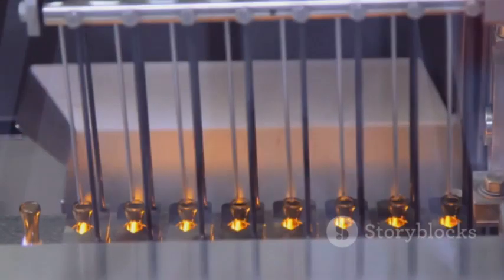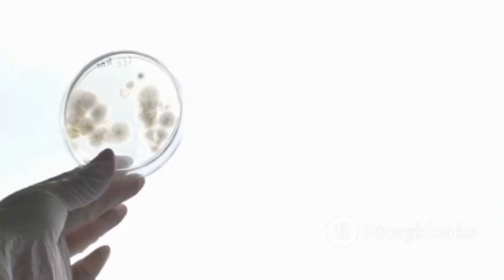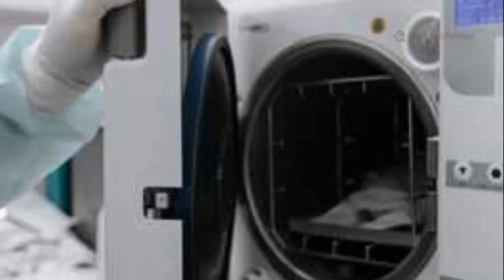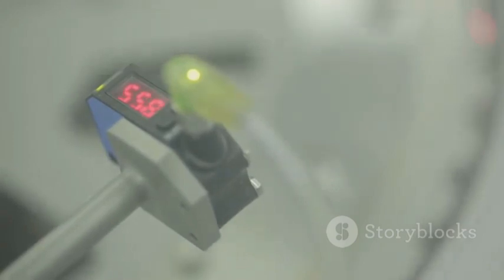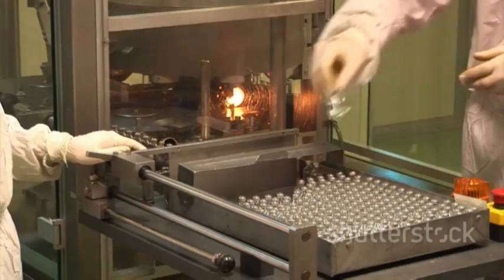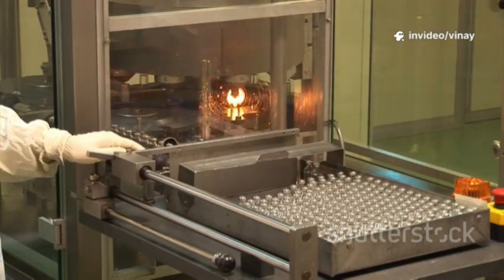A successful validation study must demonstrate a complete kill of these resilient spores, providing a high degree of assurance that the process is effective. Temperature mapping studies are also conducted to ensure that every part of the equipment reaches the target sterilization temperature for the required duration. These validation activities must be documented thoroughly and re-evaluated periodically.